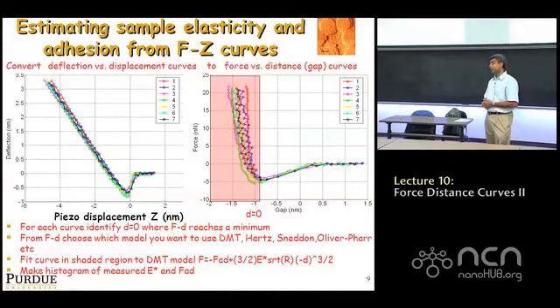But when you start doing very large indentations in very soft materials, you can't approximate the tip as a sphere anymore, and you have to go to Oliver-Pharr kind of analysis that allows you to put in force-indentation curves for conical indenters, for cylindrical indenters, conical with spherical tips. There are a lot of modifications of those things also available. Okay, but for most polymers like this, this is reasonable. Maybe for really soft polymers, you might go to JKR kind of models.